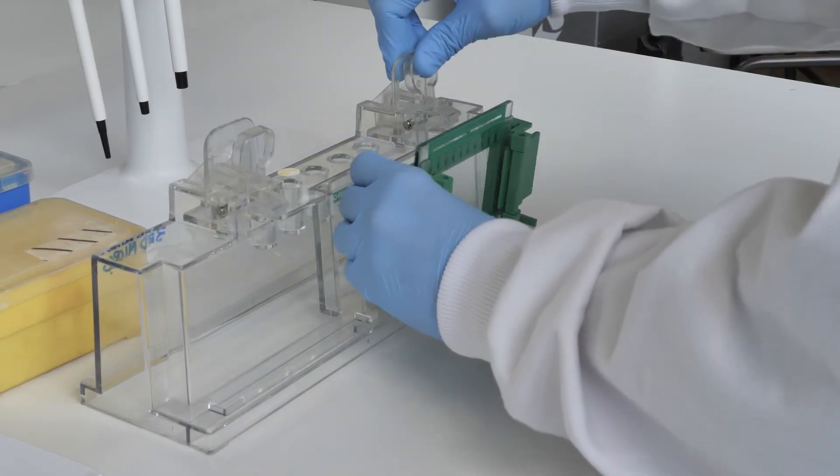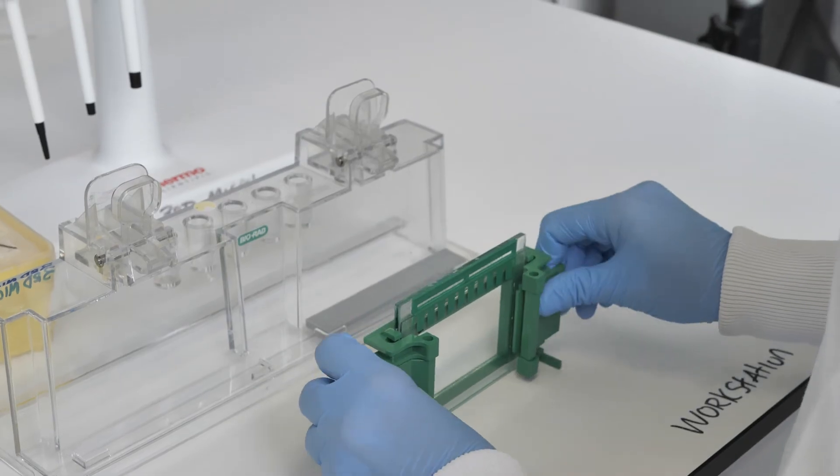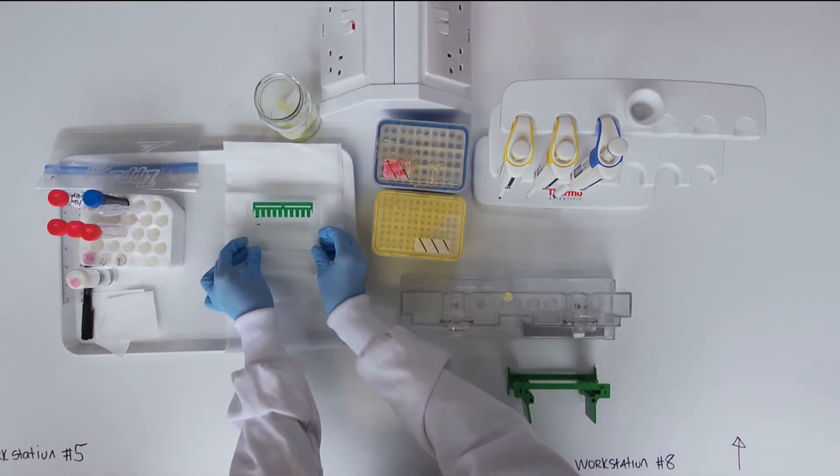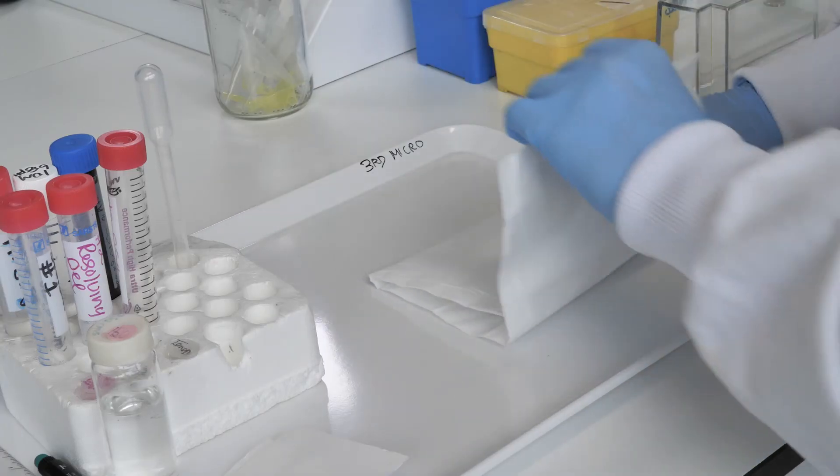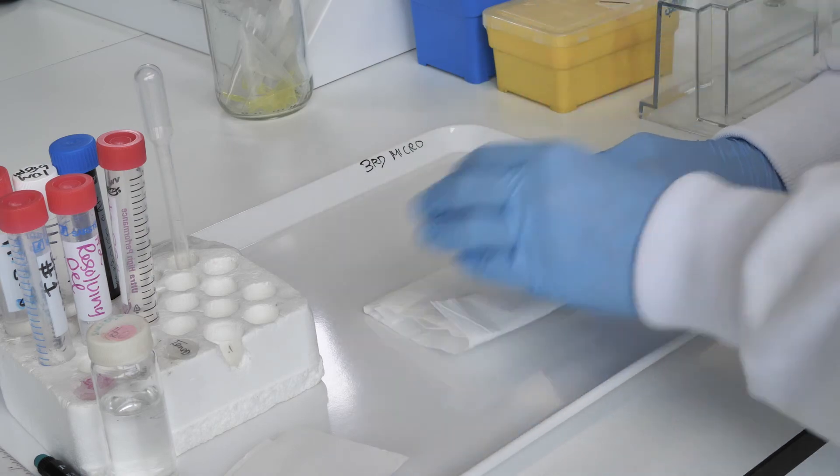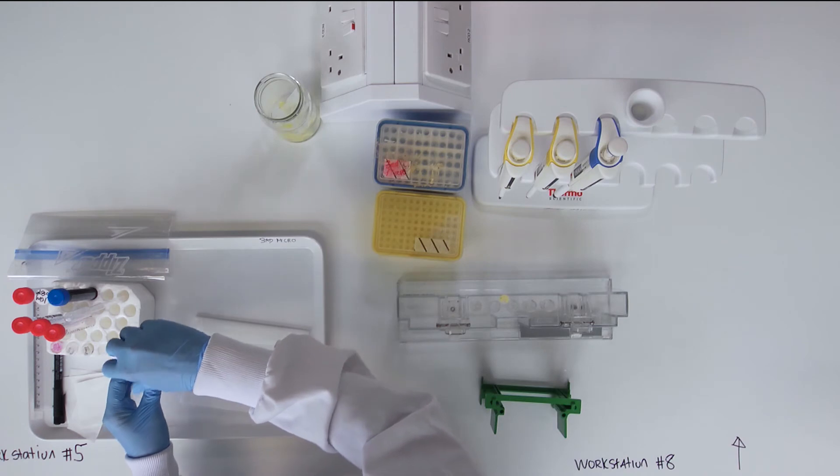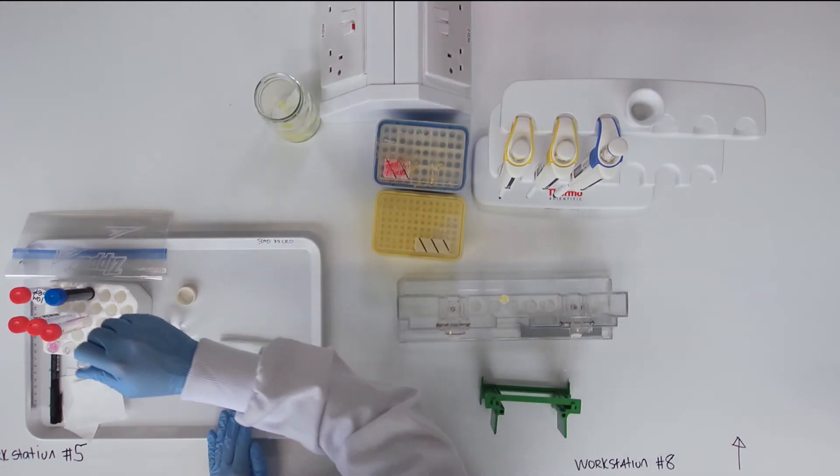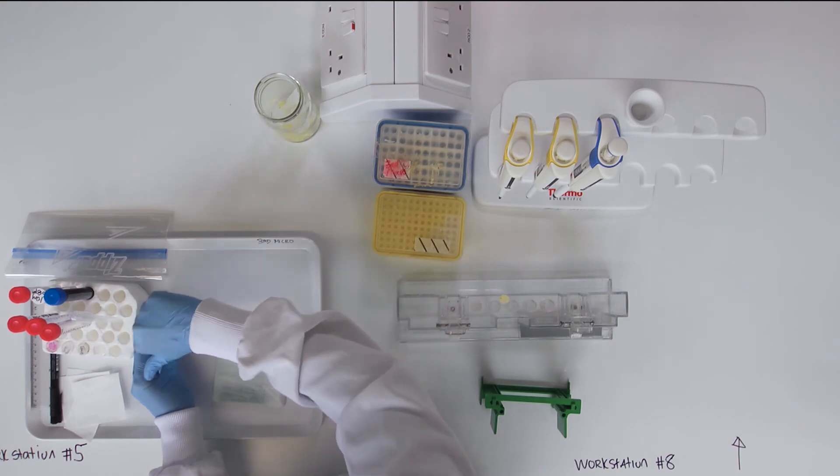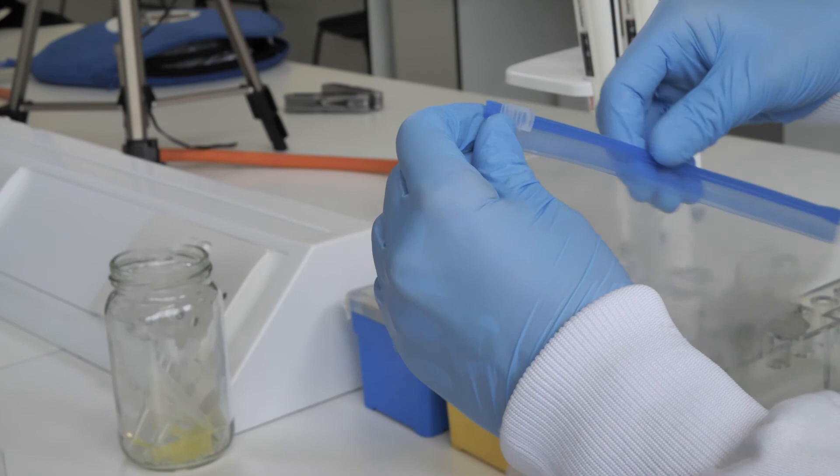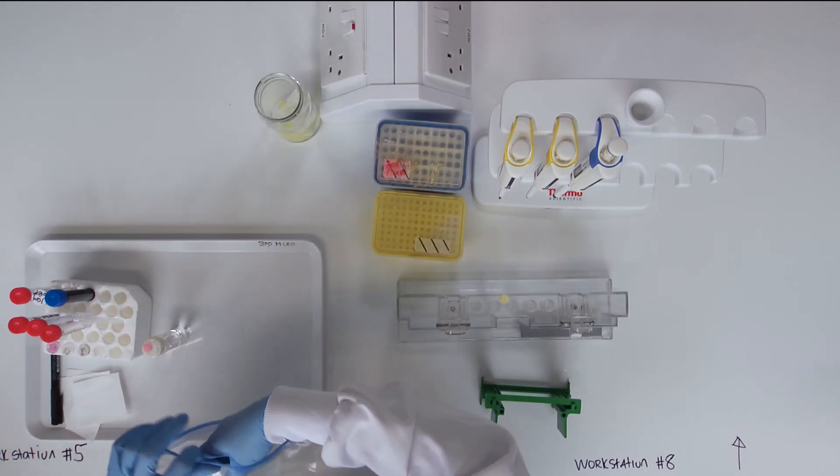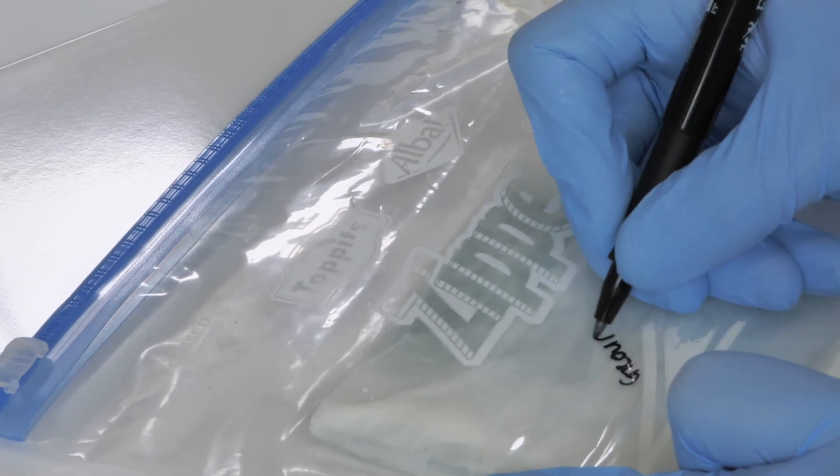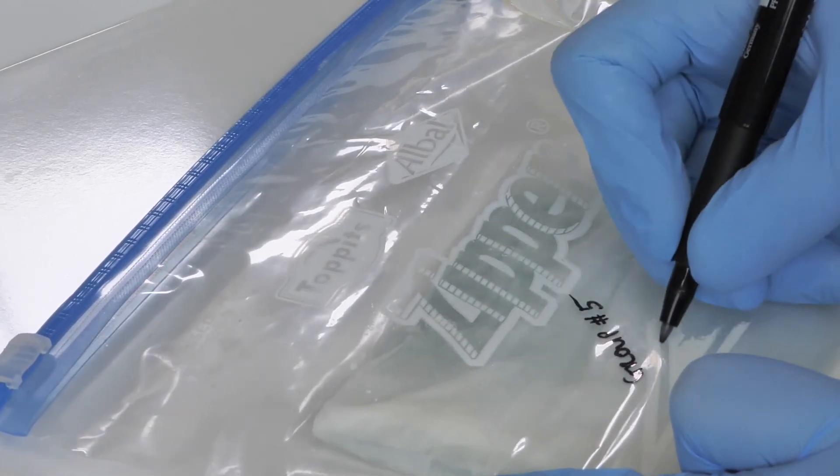Disassemble the gel casting by removing it from the stand and unclipping from casting frame. Do not remove the comb. Wrap the gel in tissue paper, concentrating on the comb end. Gently saturate the tissue paper with water. Seal in a sandwich bag to retain moisture. Write your group name on the bag or cling film. Gels will be stored at 4 degrees centigrade for use later.